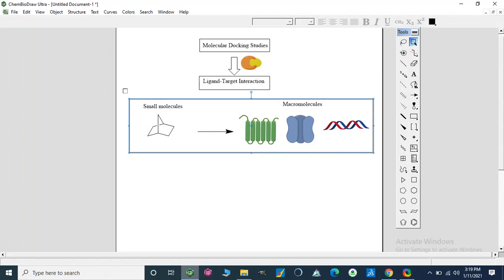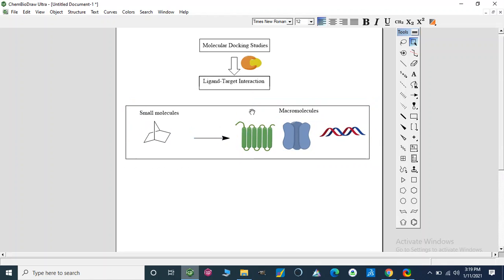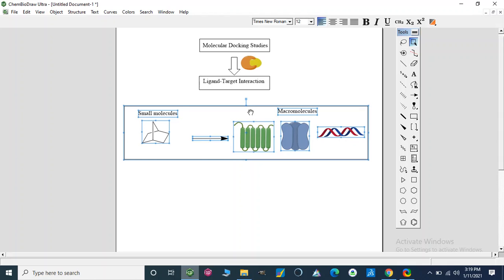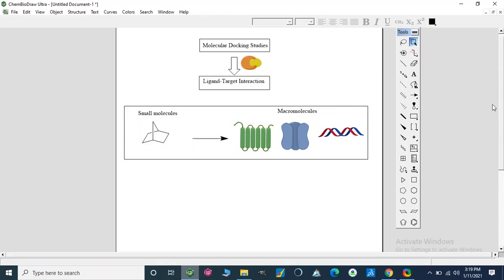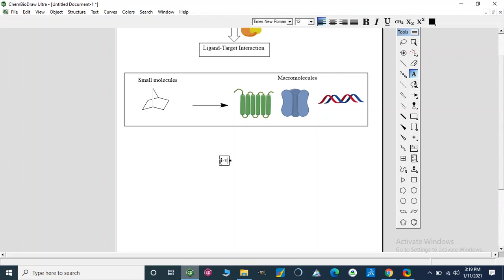Now we can select all of this — here is our ligand-target interaction. But before this, ligand-target interaction was studied through in vitro screening. So before this, we were studying in vitro.